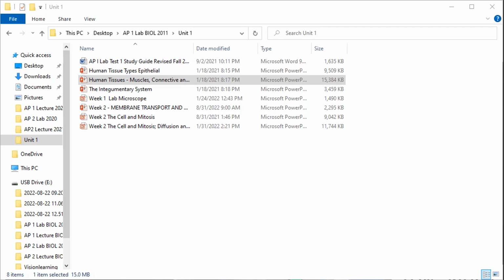We went from 33.8 to 37. I can't even do the math right. Yeah, about a 3 gram increase in water. So that one worked very nicely.